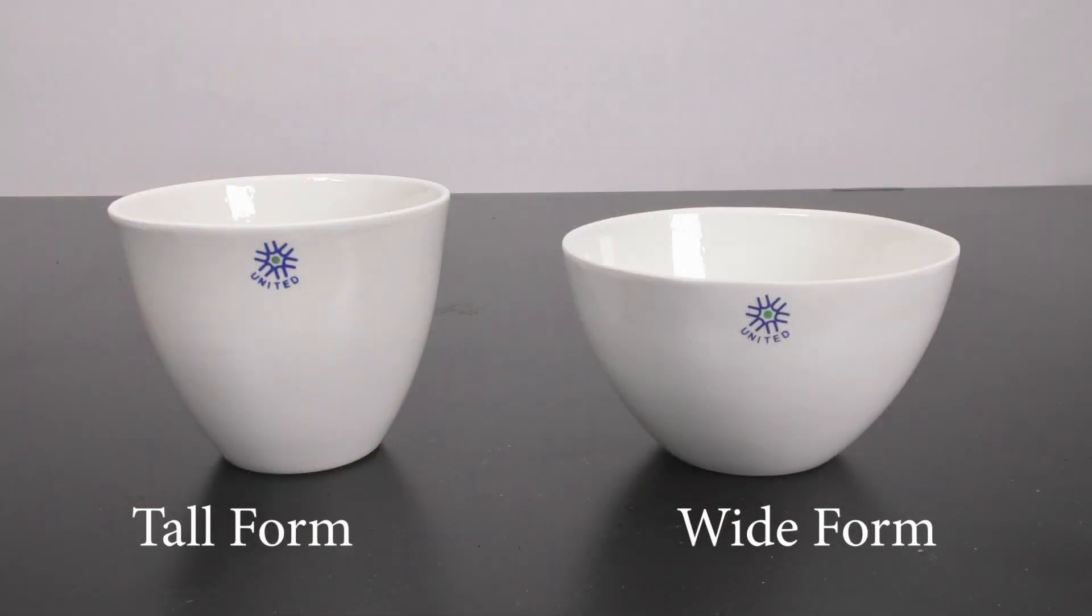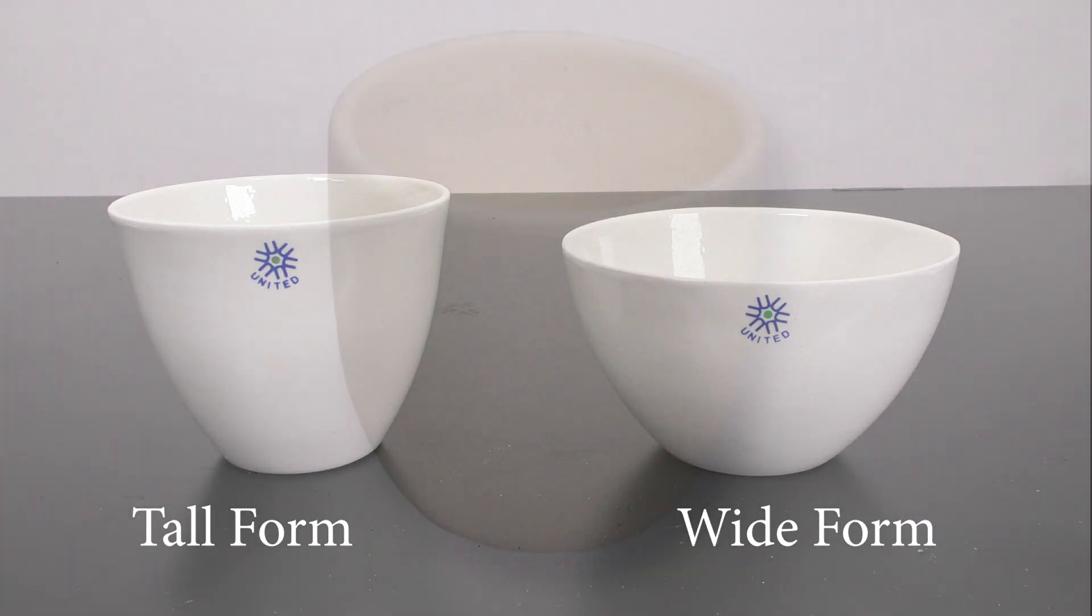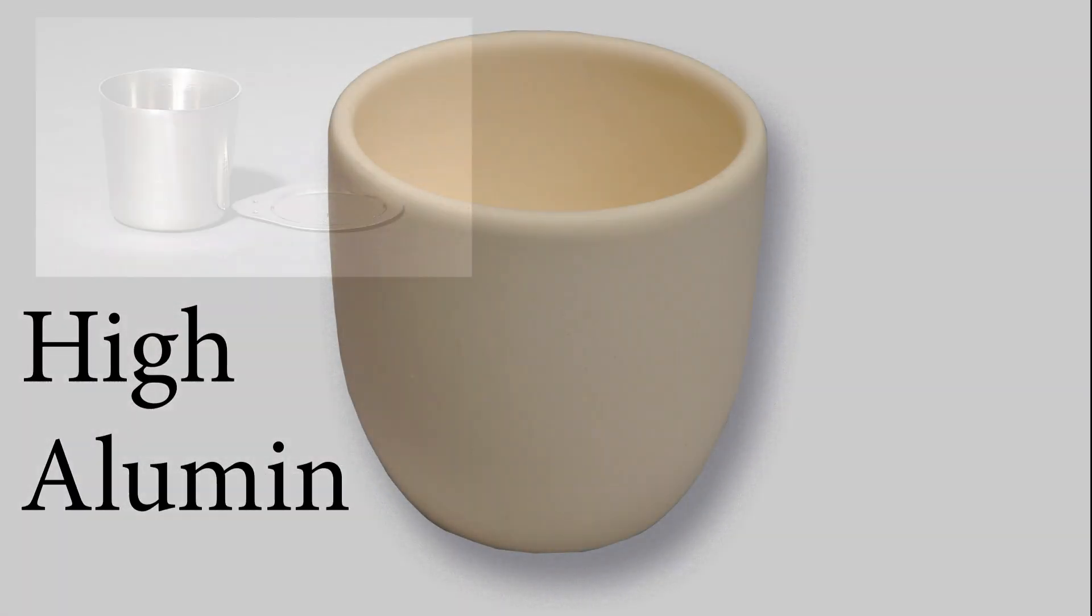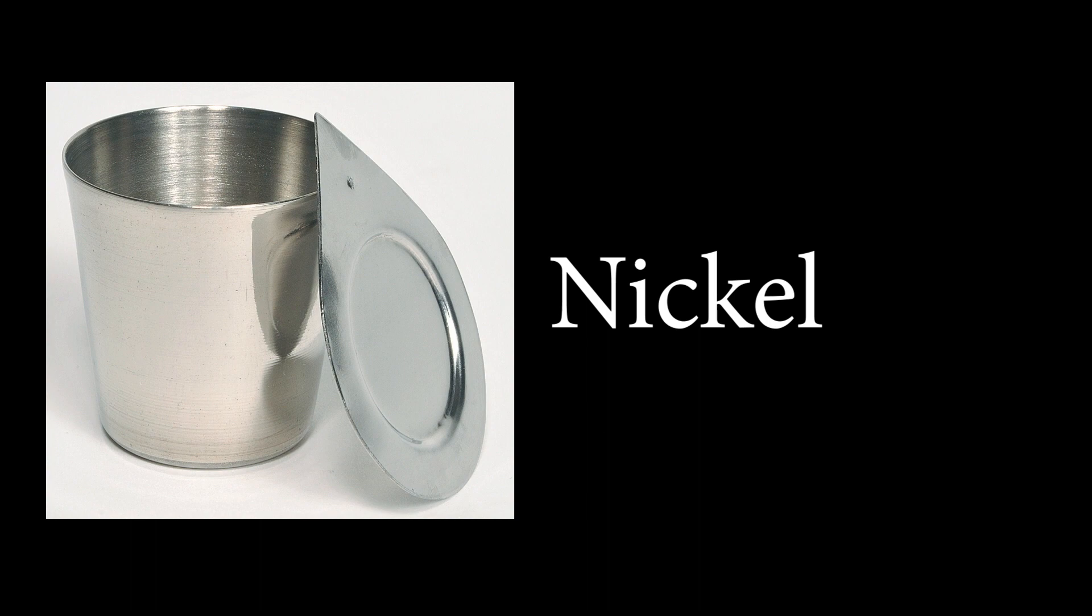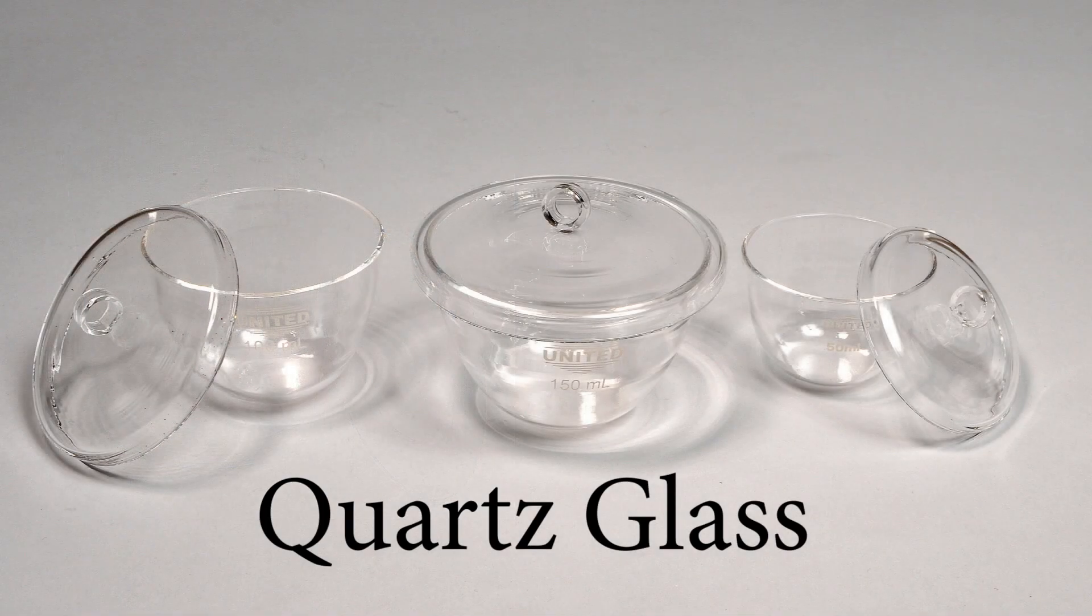Crucibles also come in different styles such as tall or wide form and they also come in different types of materials. You need to choose the correct one for your particular project.